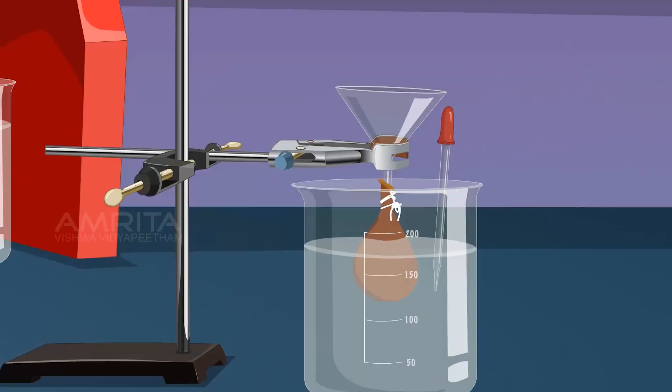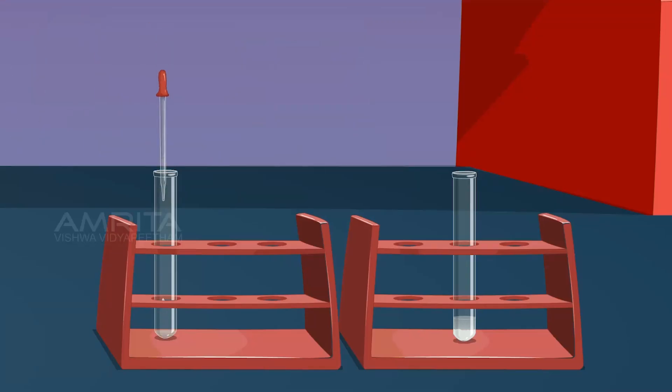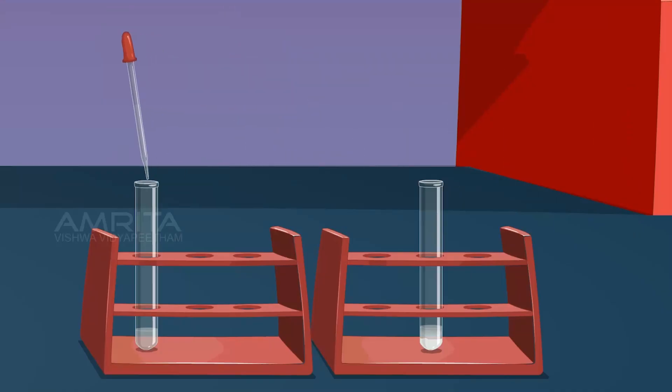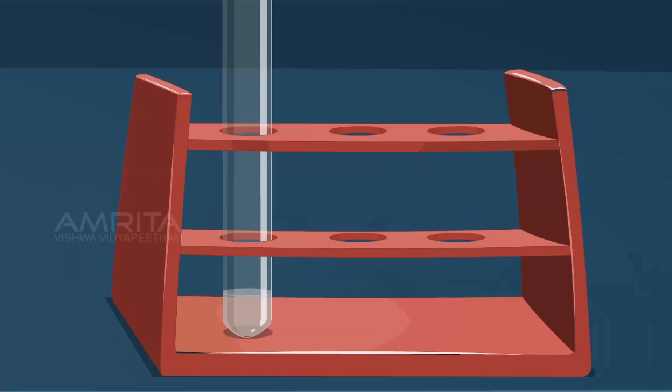Take a small amount of water from the beaker using a dropper and transfer it into a test tube. Take a few drops of silver nitrate solution using a dropper and add it into the test tube containing water. If white precipitate is formed, dialysis should be continued. If no white precipitate is formed, chloride ions are absent — this indicates that the dialysis is complete. Otherwise, the sol still contains chloride ions and therefore dialysis should be continued.